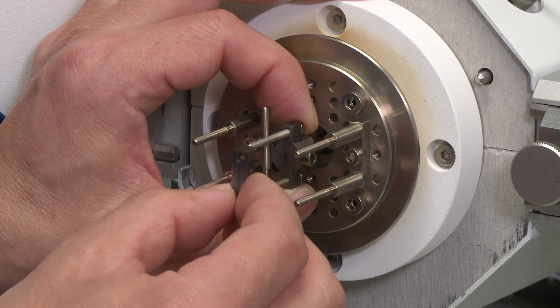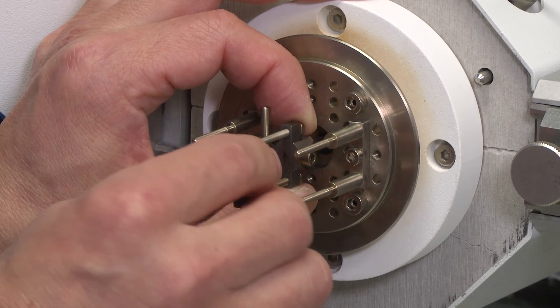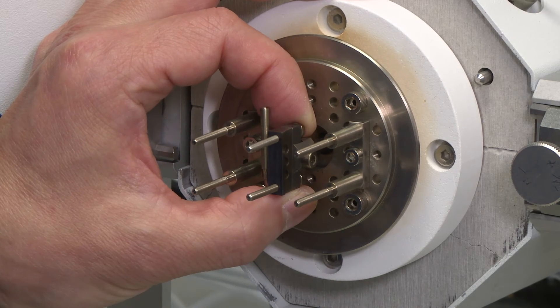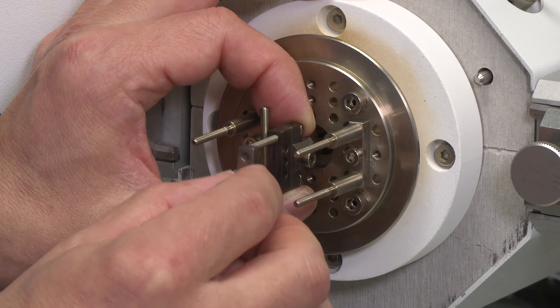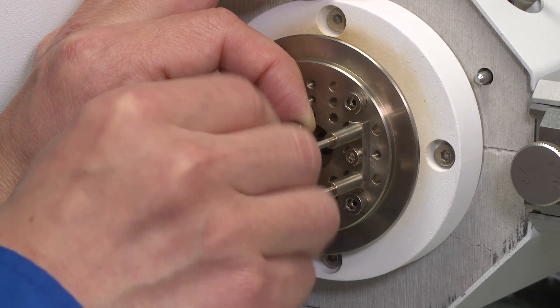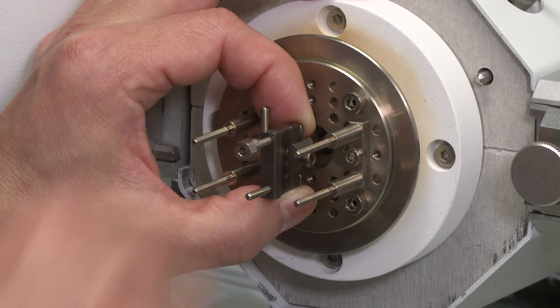First, you want to install the T-bar on the drive shaft. While doing so, you want to hold the drive shaft. Make sure it's not damaged due to pushing or pulling. Just finger tight for calibration first.